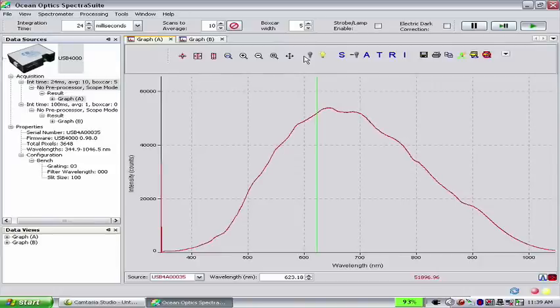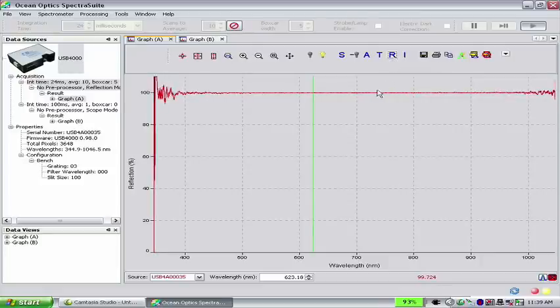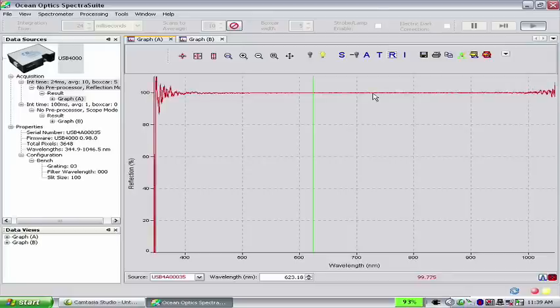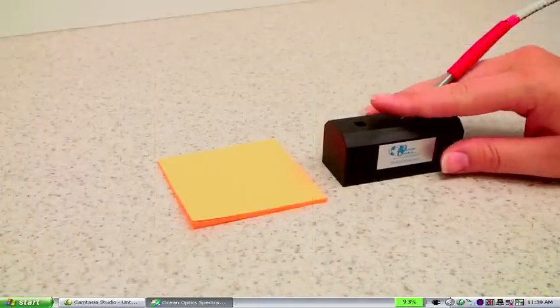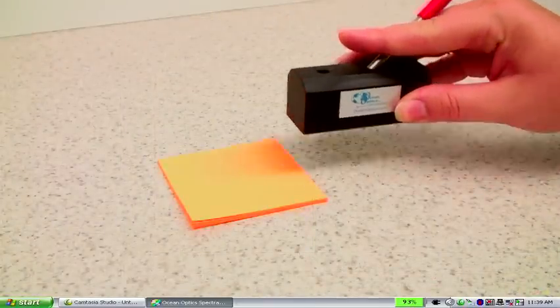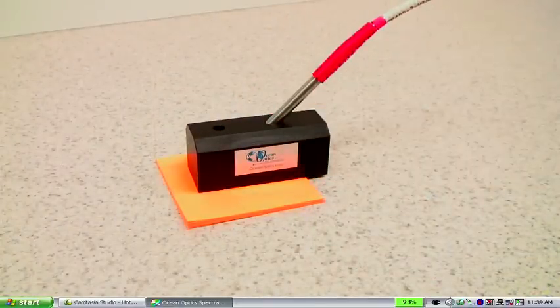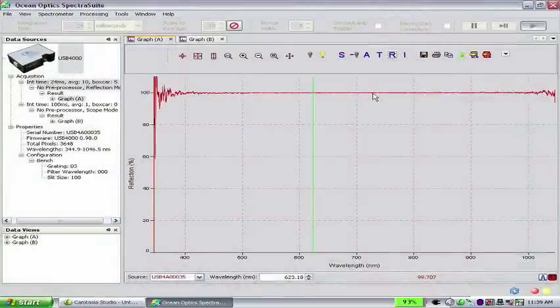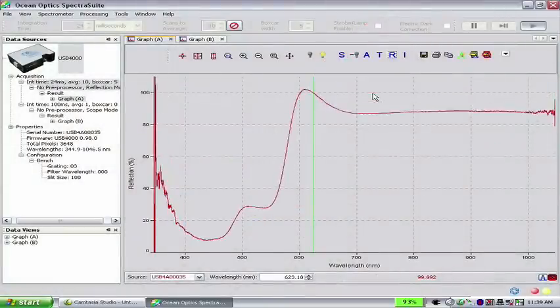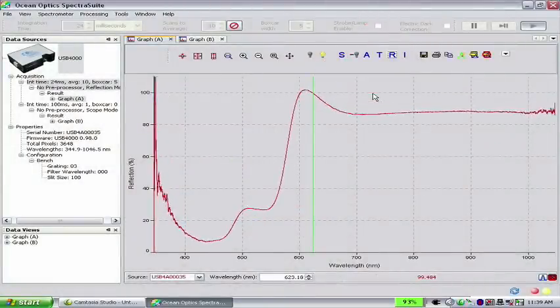Clicking on the Reflection icon changes the graph into a Reflection Process Mode. You should now see the flat spectrum of 100% reflection, just as you saw before. Now place the RPH1 on the sample to be measured, just as before. You should see a similar reflection spectrum to the one you arrived at via the wizard.